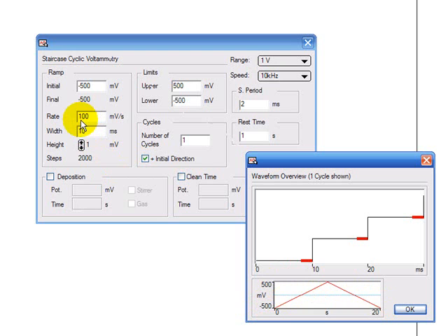With the rate I've chosen here, 100 millivolts per second, this experiment is going to take 20 seconds.